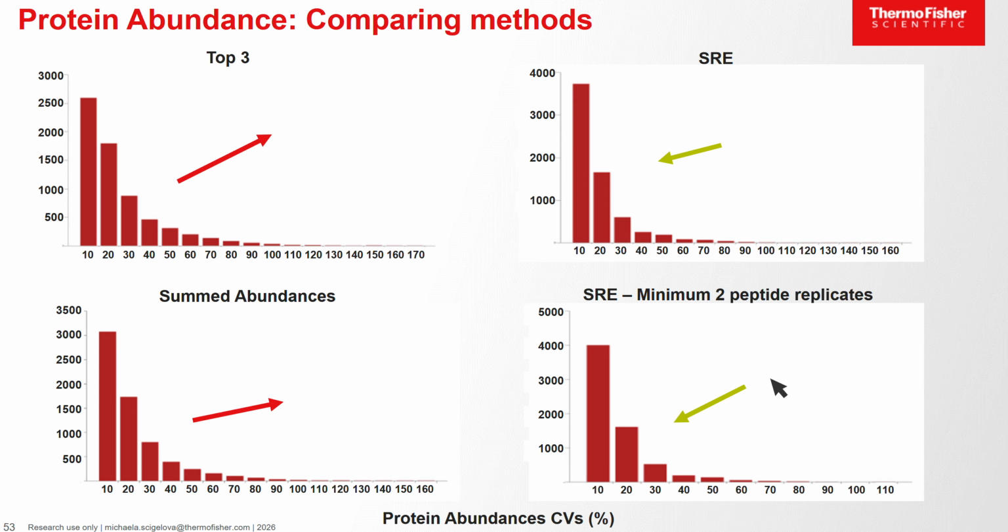You see these plots here for different quantitation approaches, different abundance value calculation. And as I said, if you then on top of it engage this minimum number of peptides filter, you should get a further improvement. But of course, you will lose some of the peptides, or you will exclude them from contributing to your quantitation. So that's working on top of that.